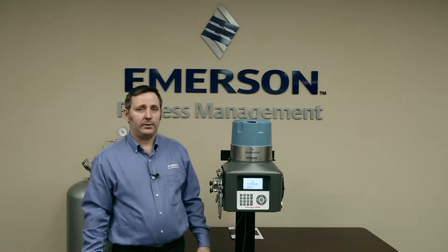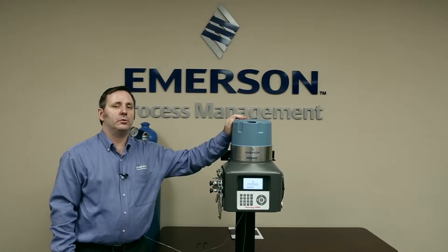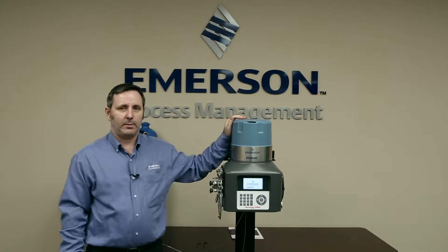G'day, it's Shane here from Rosemount Analytical. Today I'm here to show you how to change the maintainable module in the 370XA gas chromatograph.